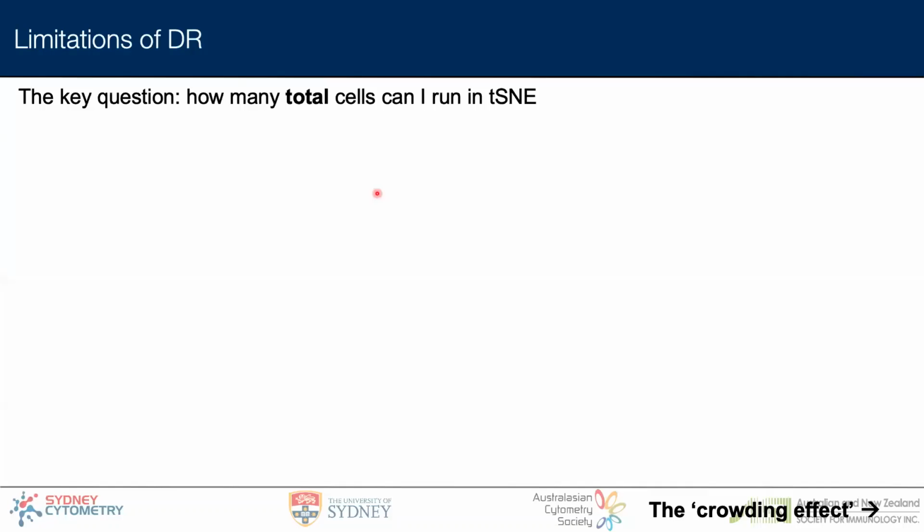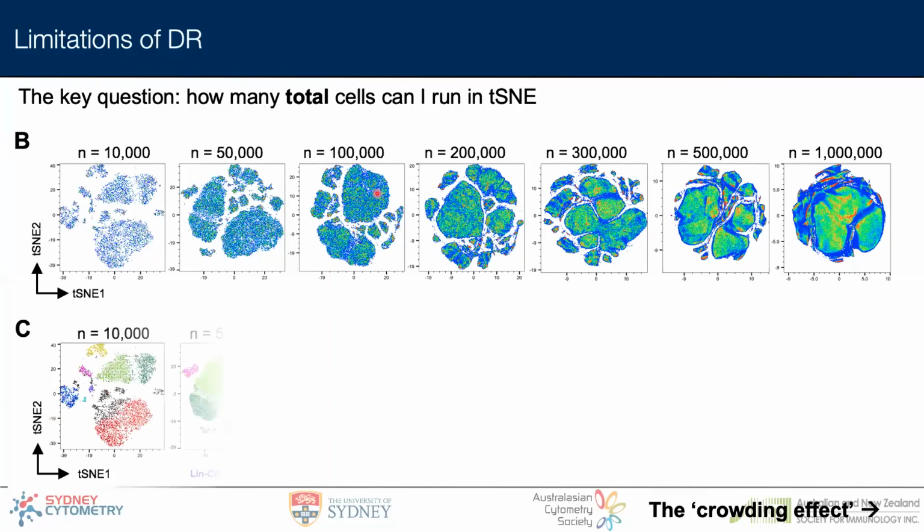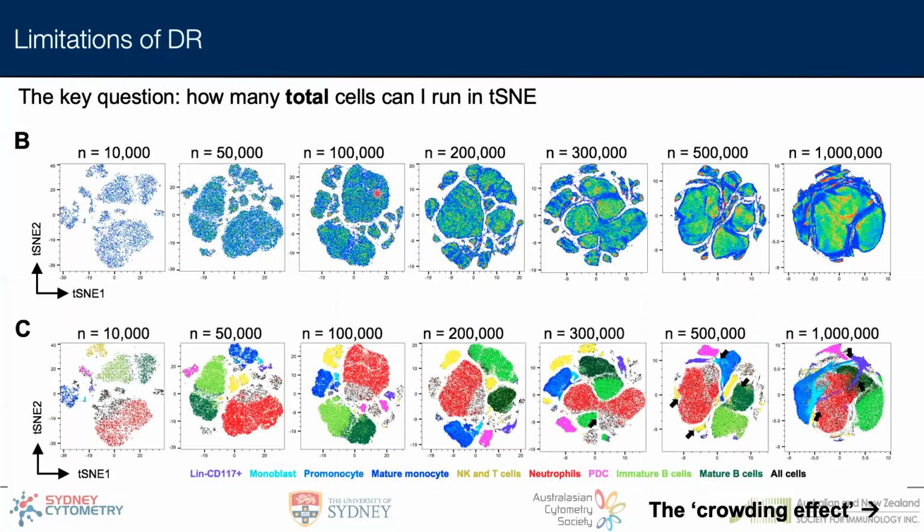So we'll move on to dimensionality reduction. There's a lot of aspects that are important for both dimensionality reduction and clustering, obviously. So there's a few more that will pop up in a bit. But one of the big things with dimensionality reduction, again, Tom mentioned this, I think, on Monday, is this crowding or saturation effect.